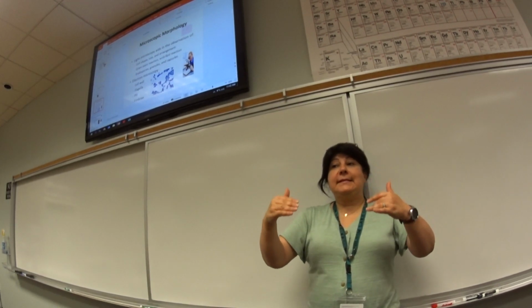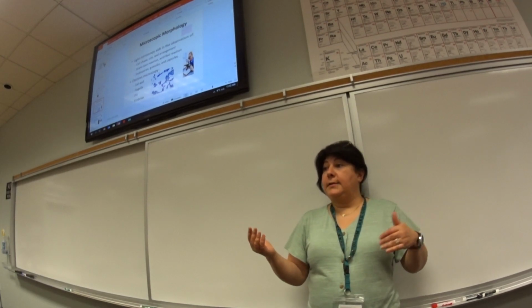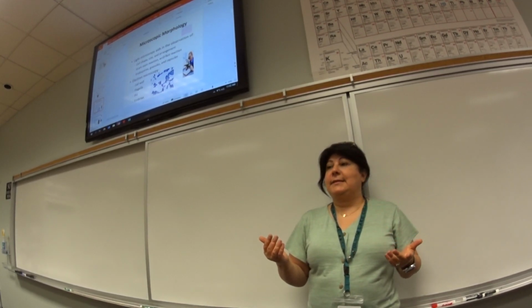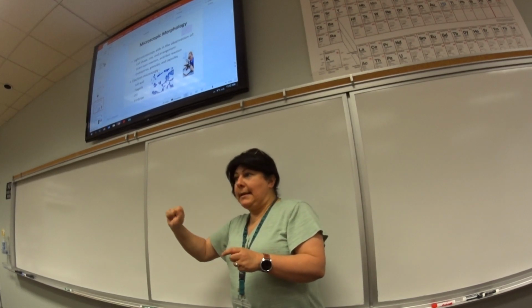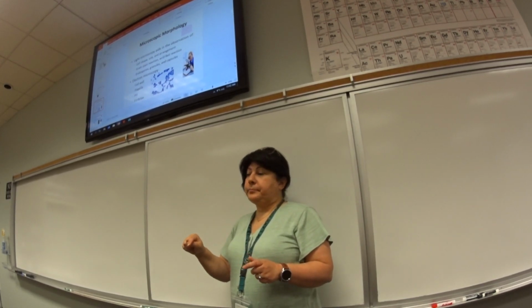So at every step, like this was just a few, but for gram-negative rods that are oxidase negative, all of those, 5, 6 that you have to, in your conclusion, step by step, keep eliminating and tell me eventually because it's this.